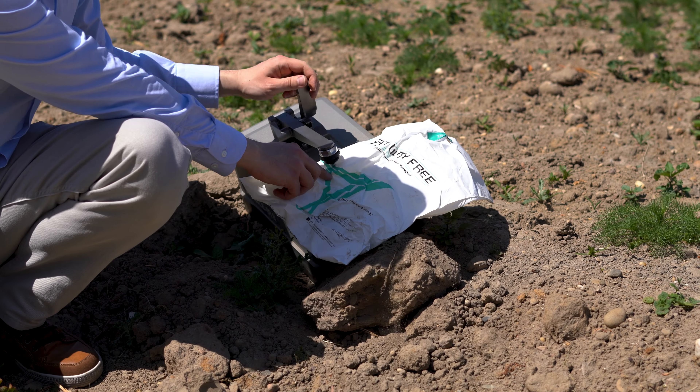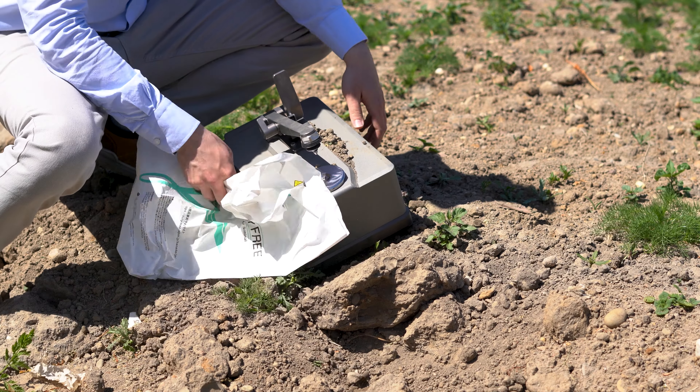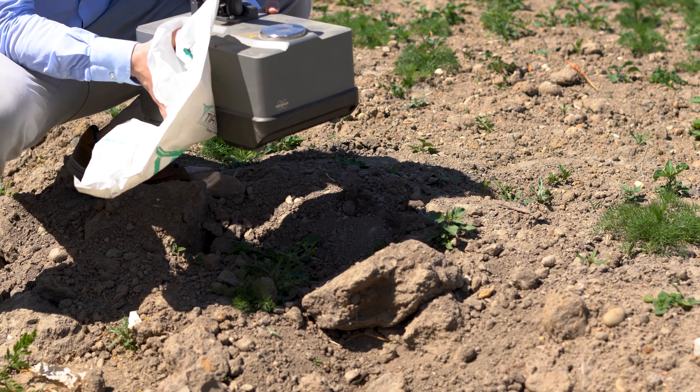We grab this piece of plastic from the ground and identify it within seconds. You got dirty — let's get you cleaned up.